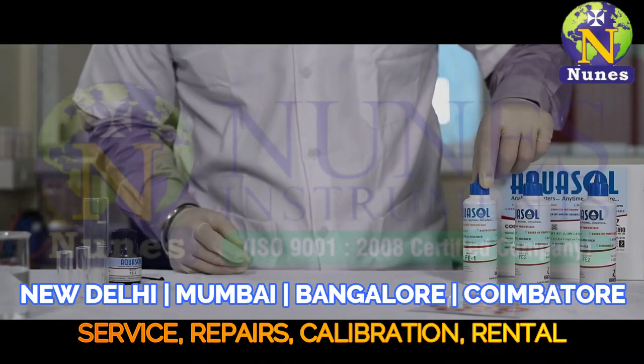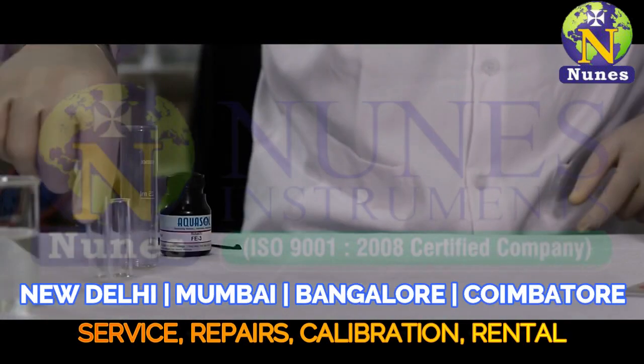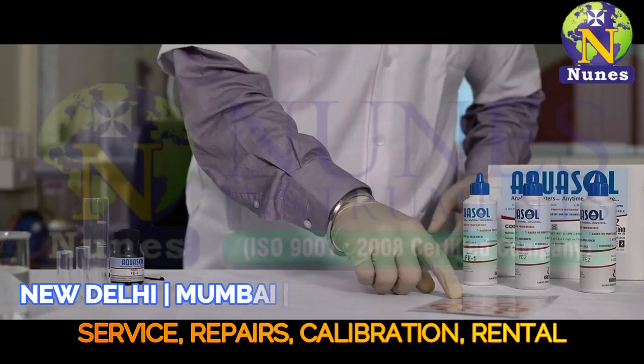This kit contains Fe1, Fe2, and Fe3, along with a test jar, comparator tube, and color shade chart.